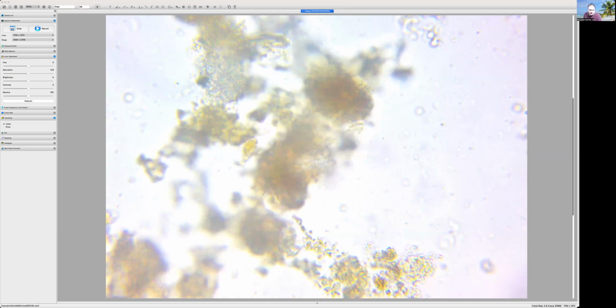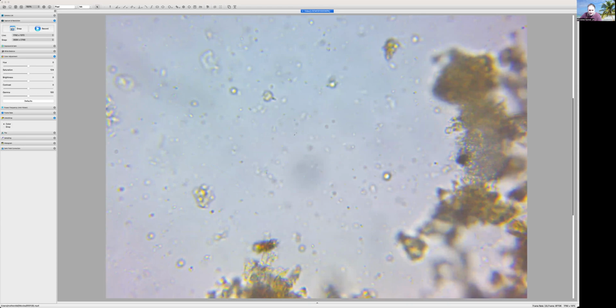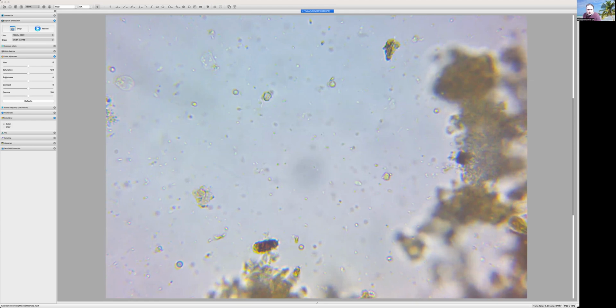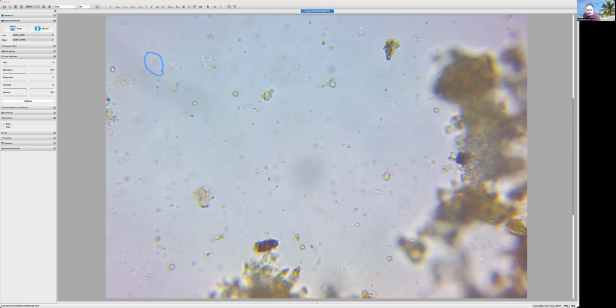I want to move away from this big aggregate here because there are these two cute little flagellates over here getting themselves in a lot of trouble. I think their tails are tangled. But so I think this is at least a three. We're on day three now, probably. We've got a flagellate there. Testate amoeba here.